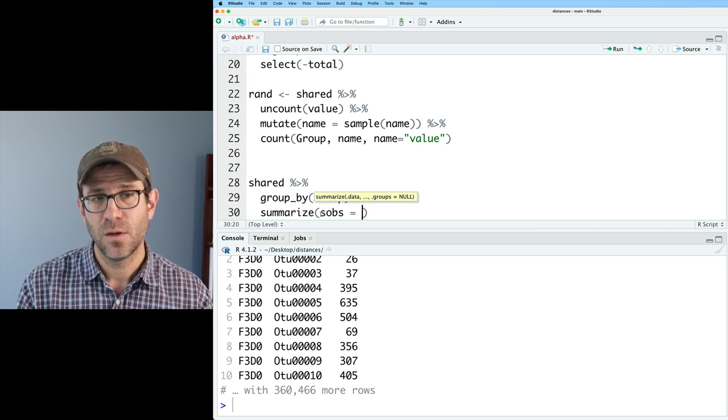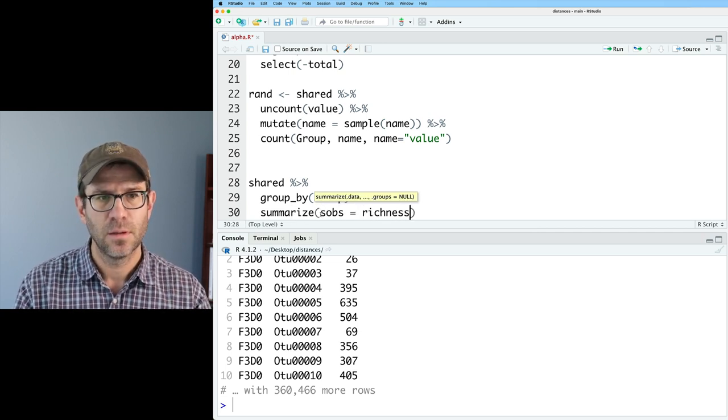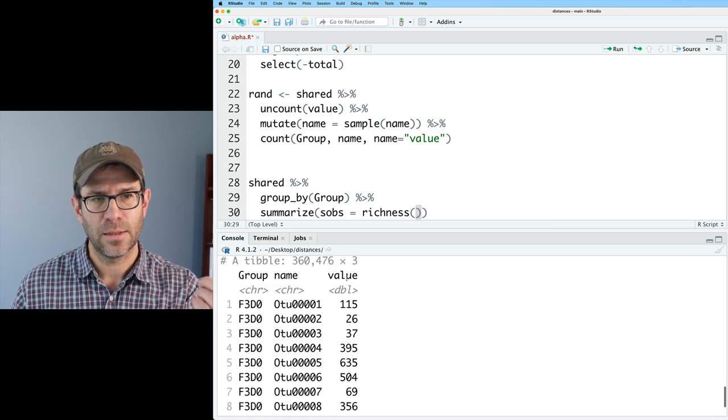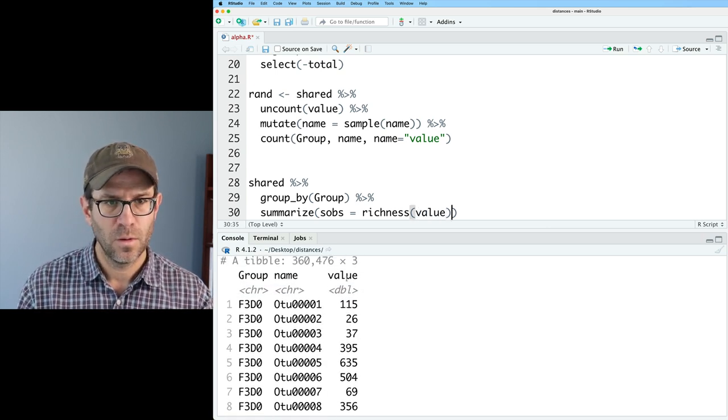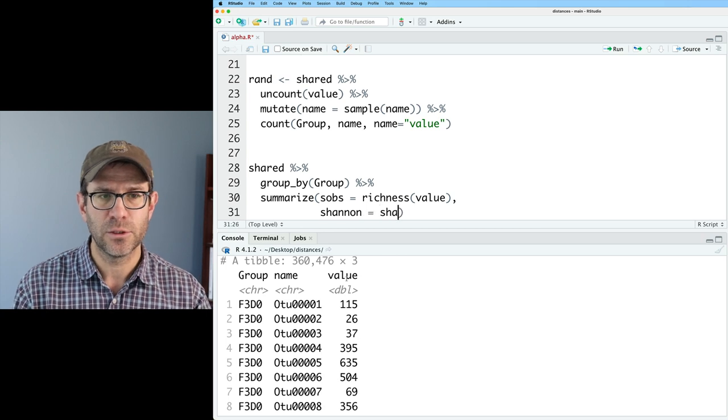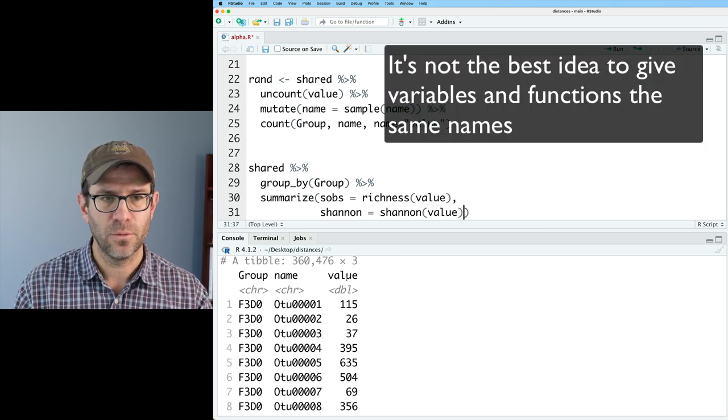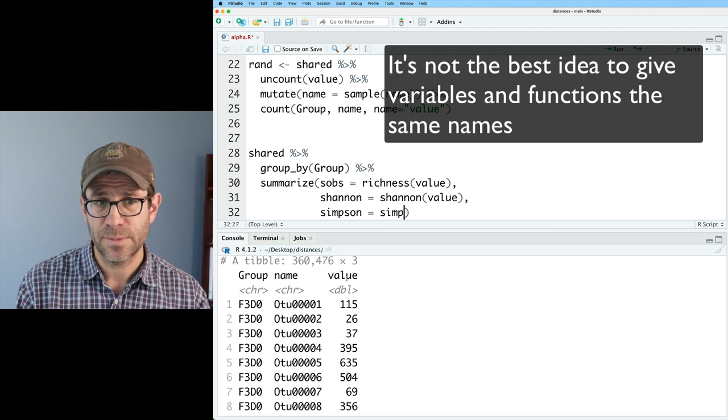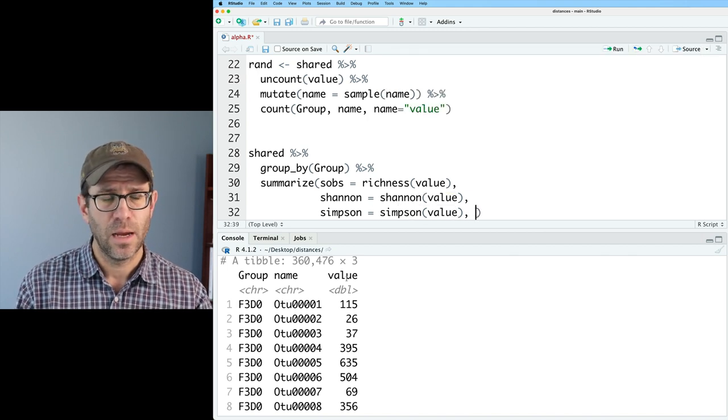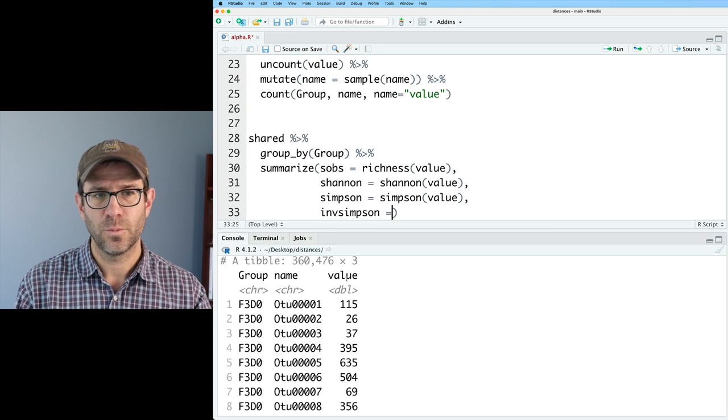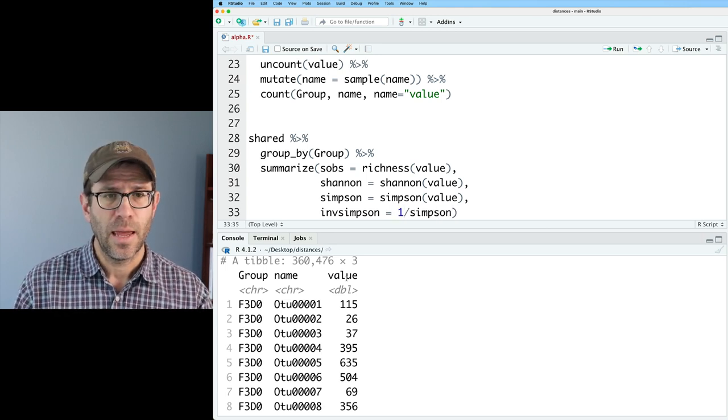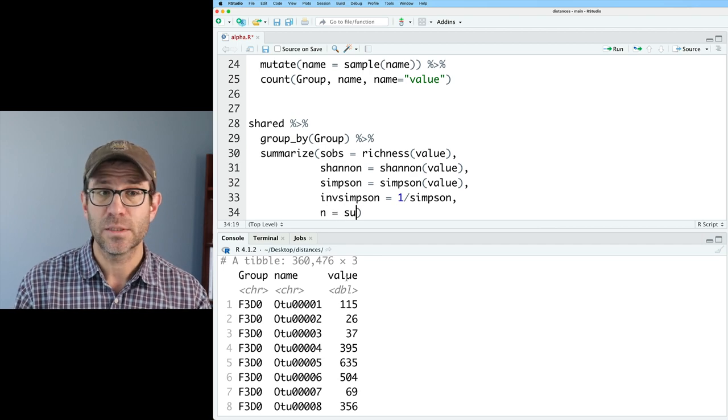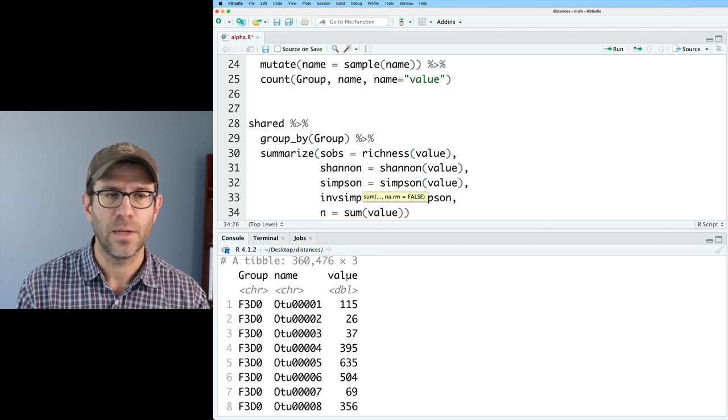I'll say sobs, which will be my richness on the data that's in the value column. I'll also do Shannon, which will be Shannon on value. Also do Simpson, which will be the Simpson on value. And then I'll do inverse Simpson, which will be one over Simpson. And then I also want the n, which will be the sum of the value column.